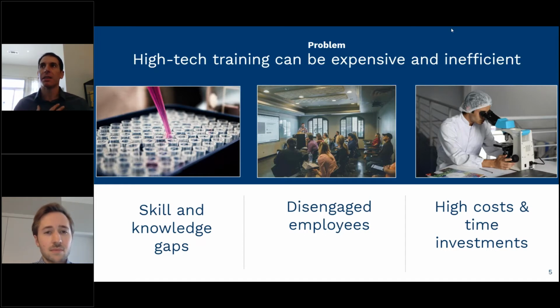And so as a lab manager, whatever your role may be, as a lab manager or director or coordinator, if you work in a lab, or you're responsible for safety training for your organization, for your employees or your users, or maybe students in some cases, I think first of all, there is an ethical obligation to make sure the lab space is safe, right? And the second is the health and safety of your actual employees and clients and users and students.